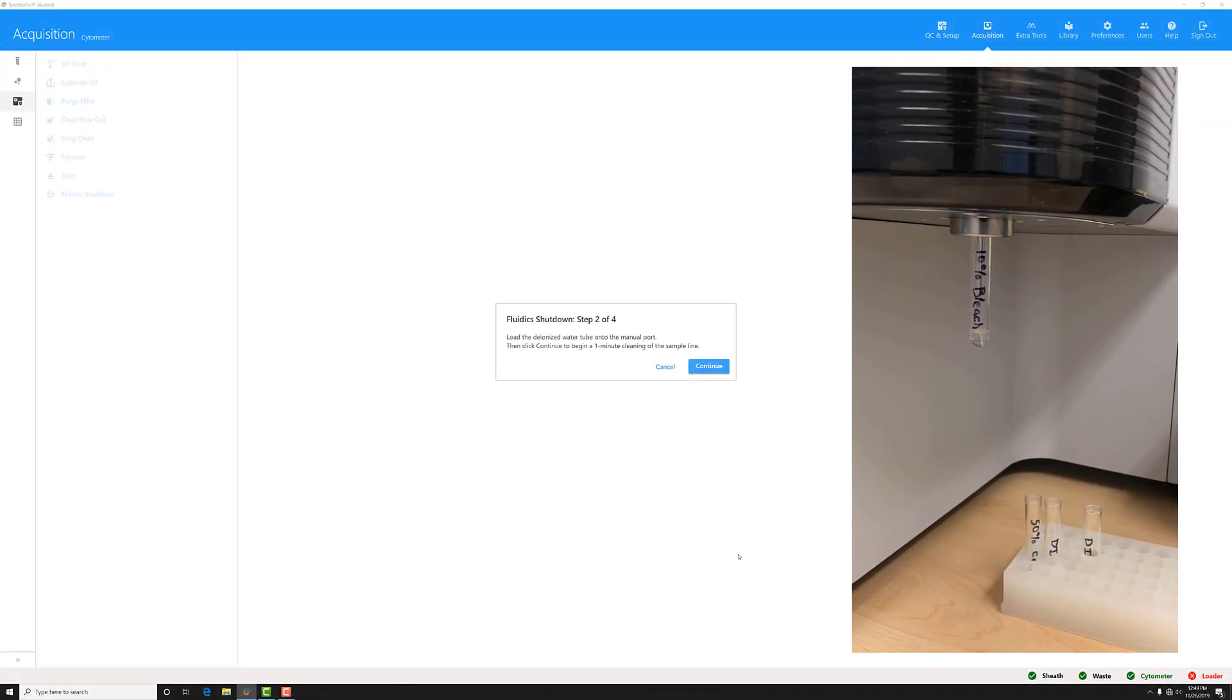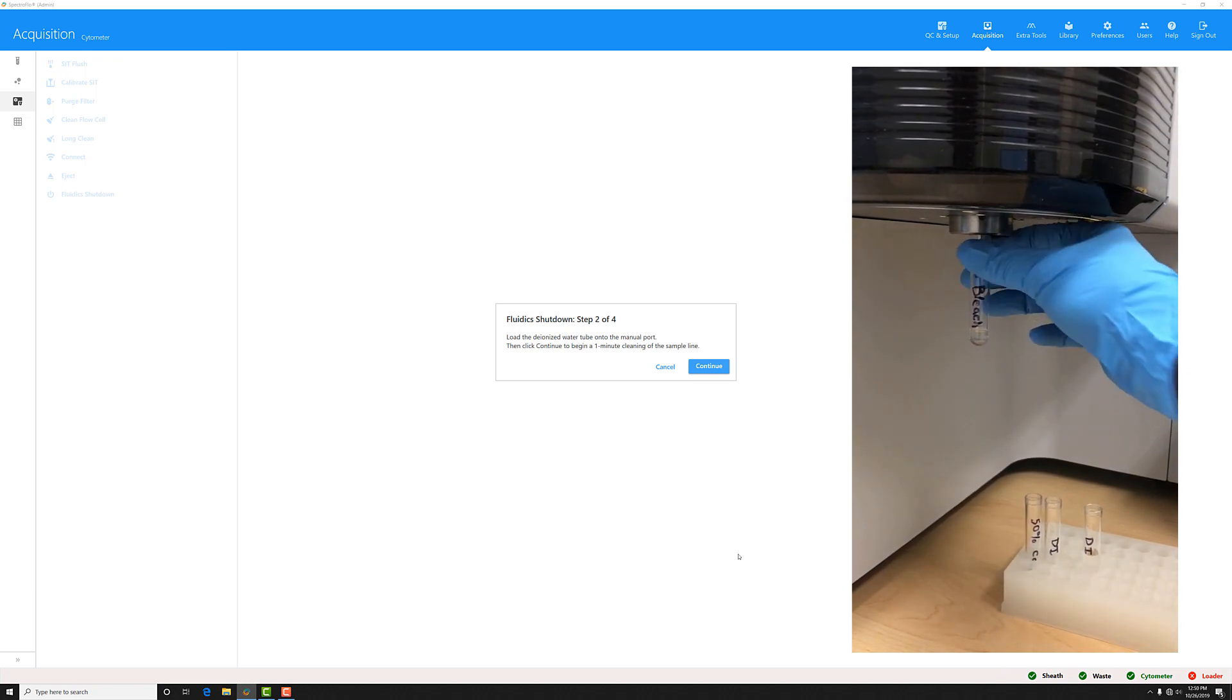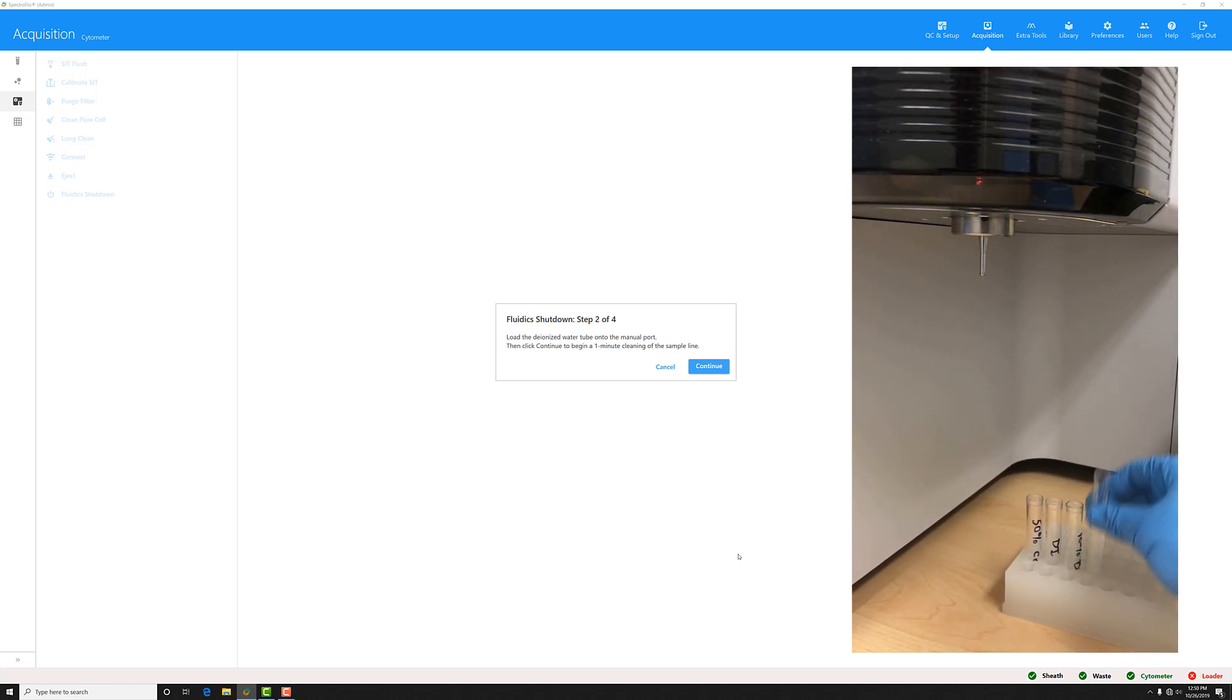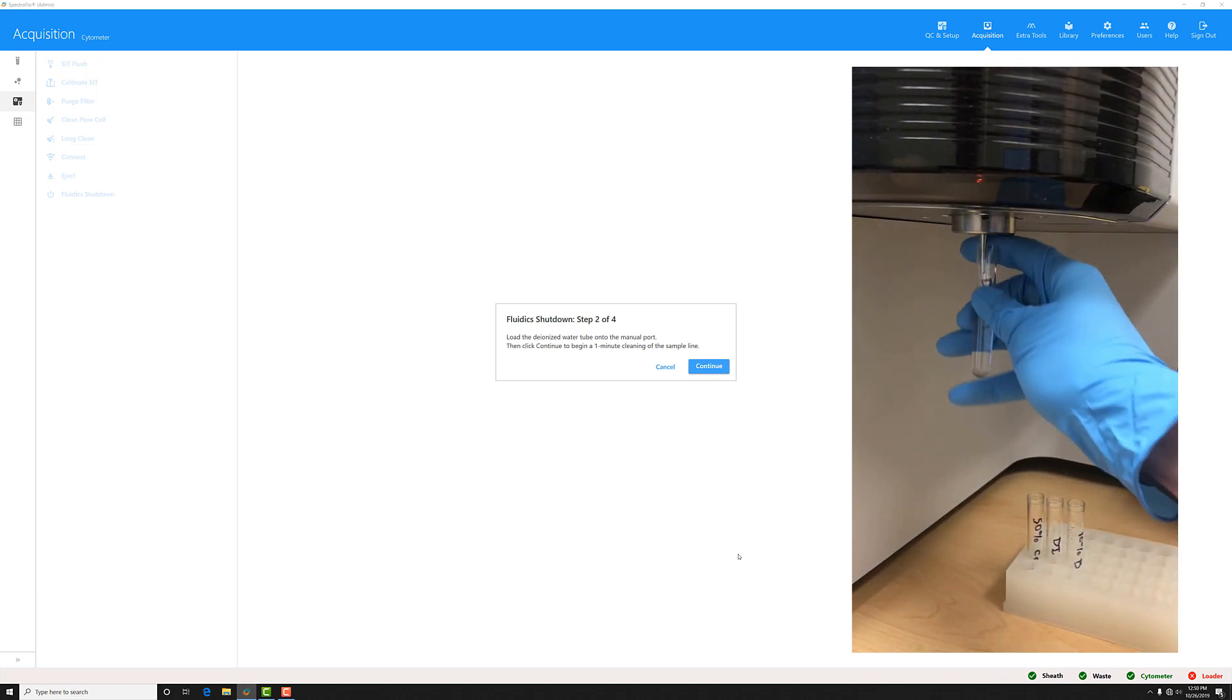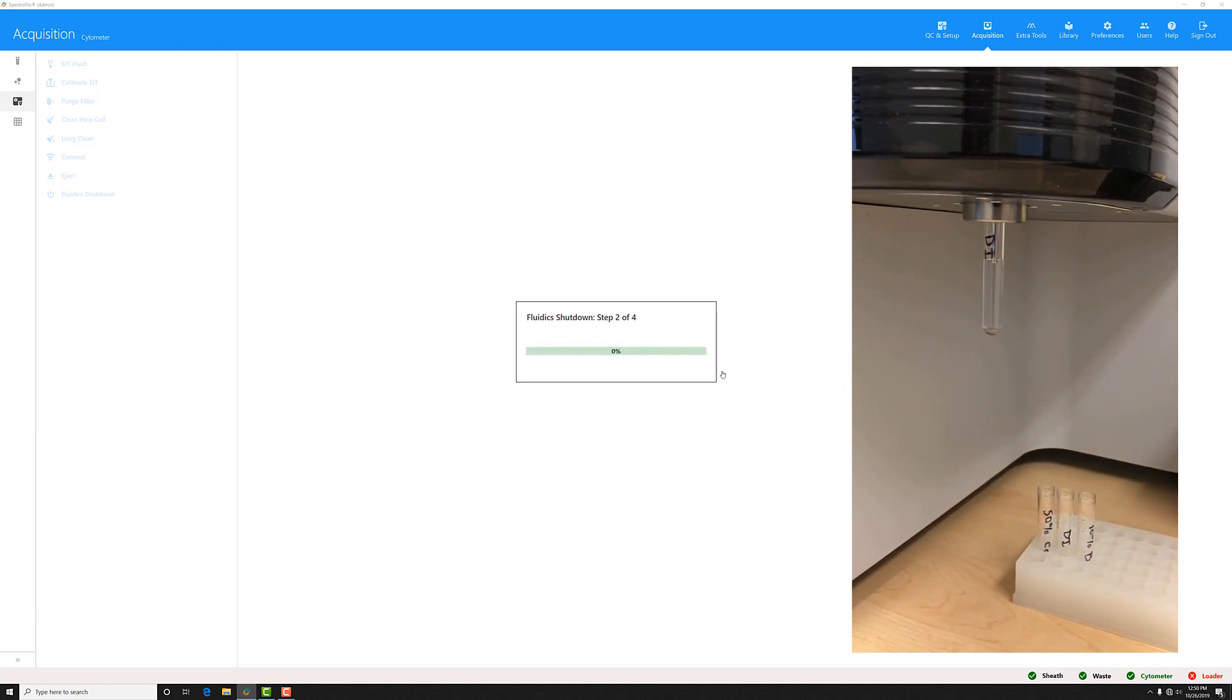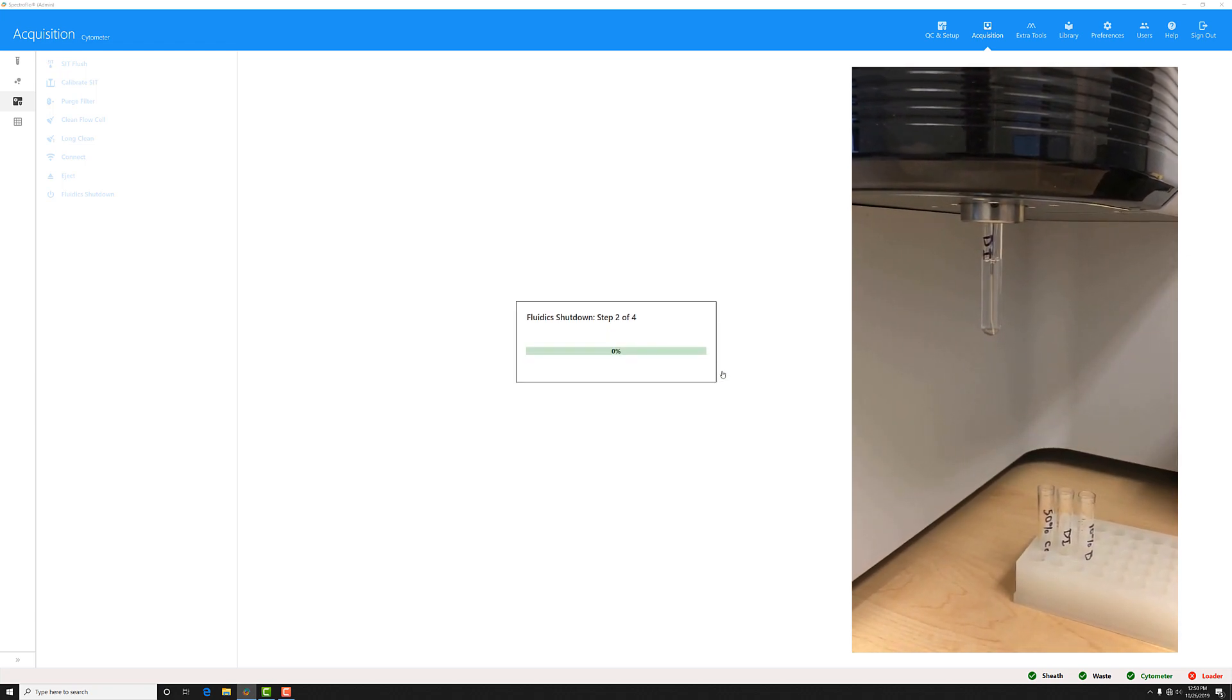Next, unload the first tube. Grab your tube of DI water and load that onto the cytometer. Then click continue again for another clean.